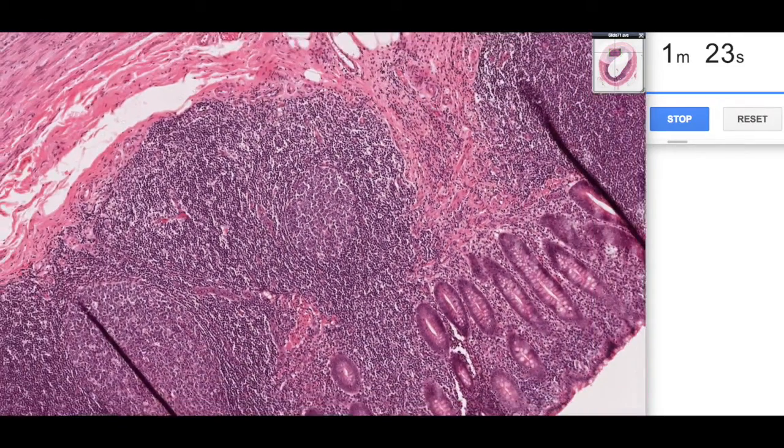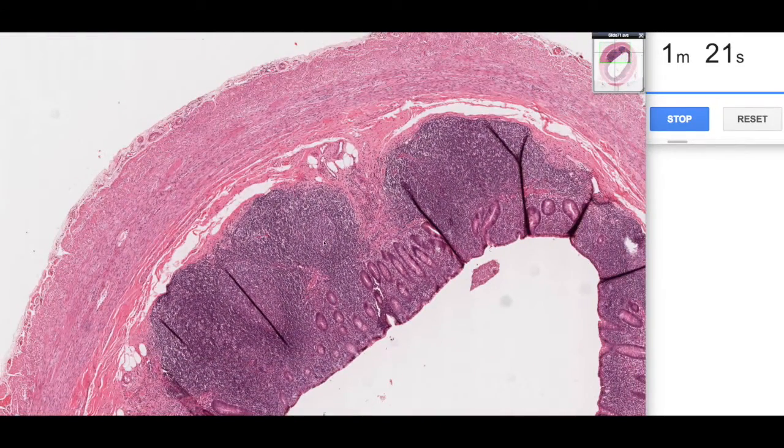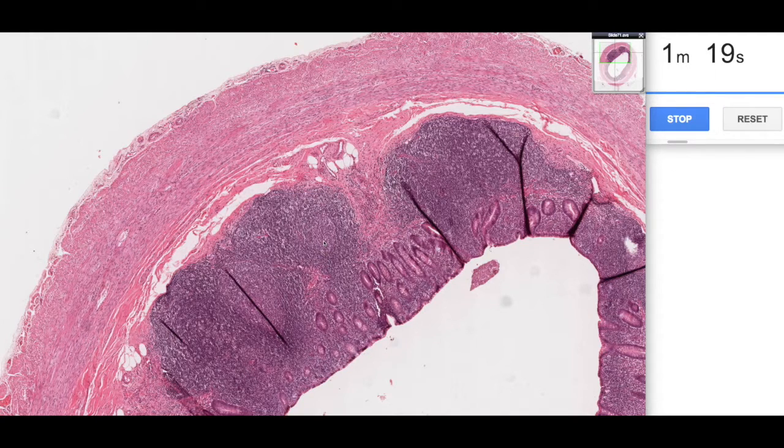So when a part of the mucosa-associated lymphoid tissue has been stimulated to produce antibodies, then you end up with this pale region here. This is what we call a secondary follicle or a germinal center.